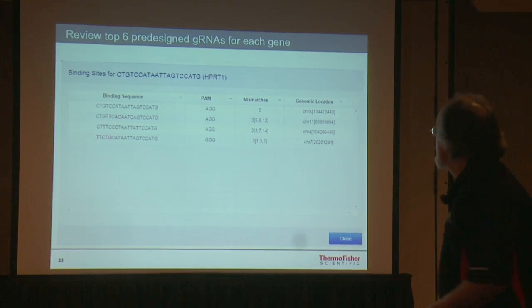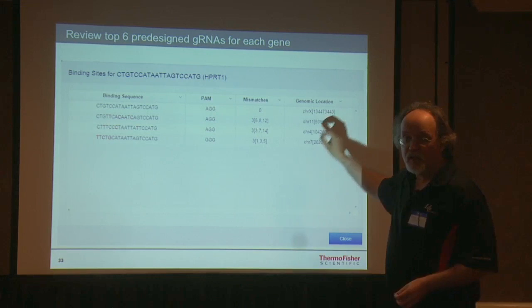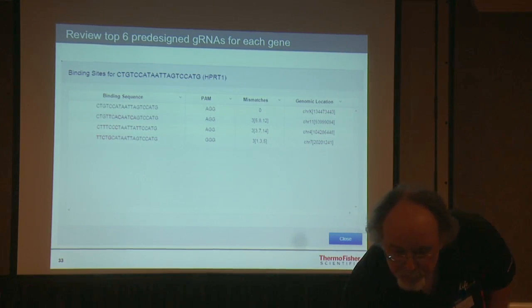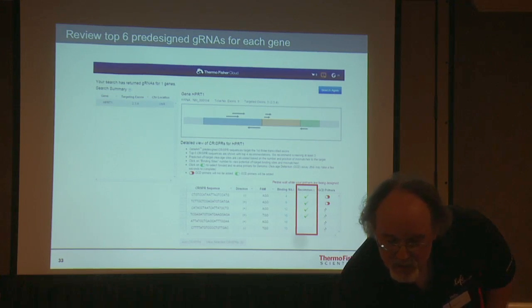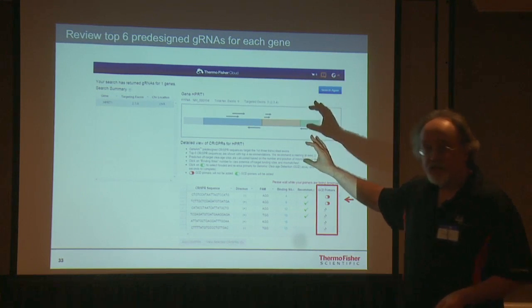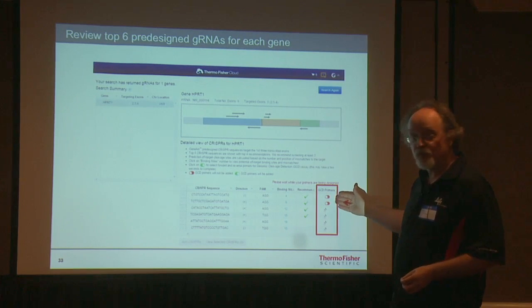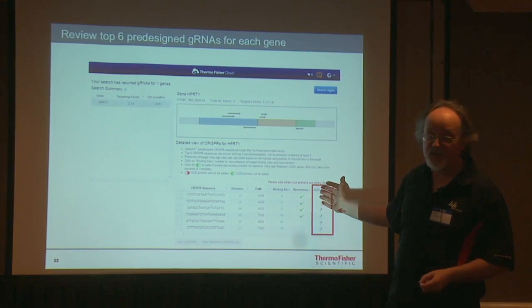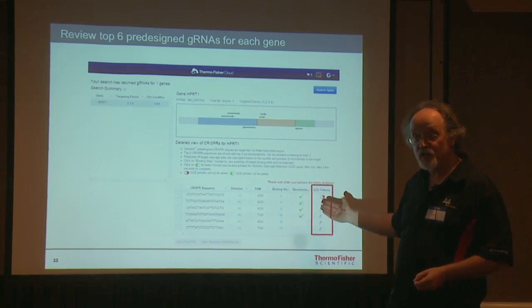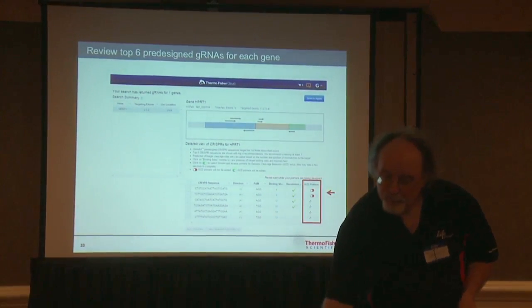You're getting information about the location of these various genomic loci, a sense of where exactly it might sit down, and where it might also sit down in an off-target way. And you're getting a series of different primers which allow you to specifically test. These are being designed on the fly based on the genomic sequence which is available to you.